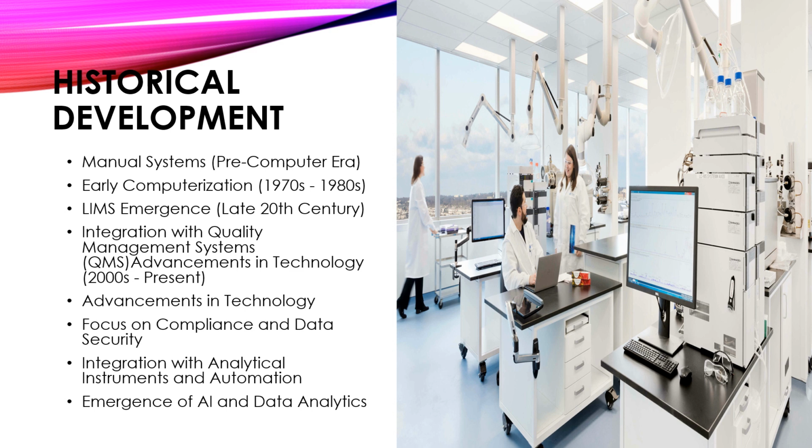Integration with analytical instruments and automation. Now, today's laboratory management systems are often integrated with analytical instruments and laboratory automation systems, enabling seamless data transfer, instrument control, and workflow automation. And this integration reduces manual errors, accelerates data analysis, and improves overall productivity in the laboratory.